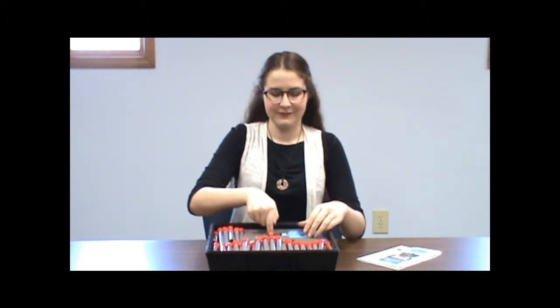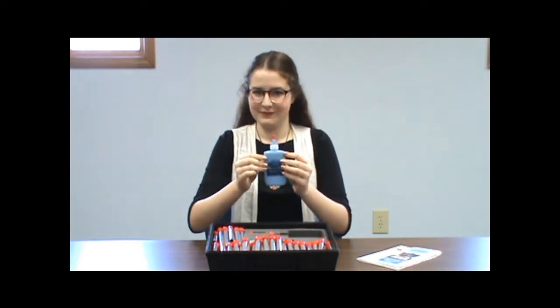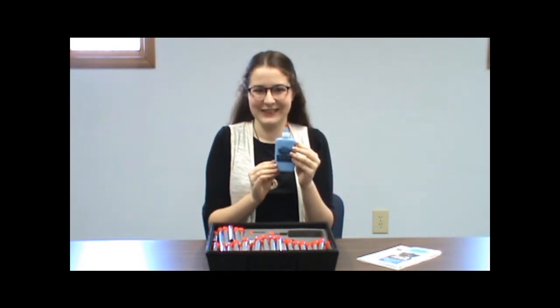Last but not least in the case is a bottle of Wonderfill. This is a high temperature encapsulate that can be used to fill the core holes that you take in the suspect asbestos materials.